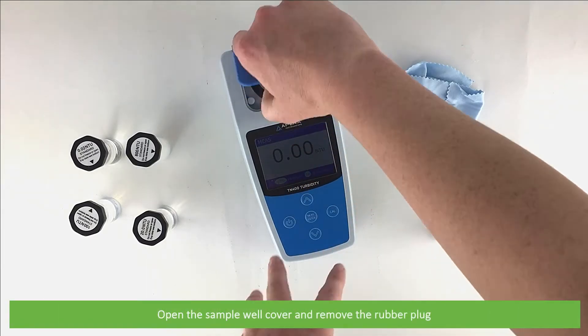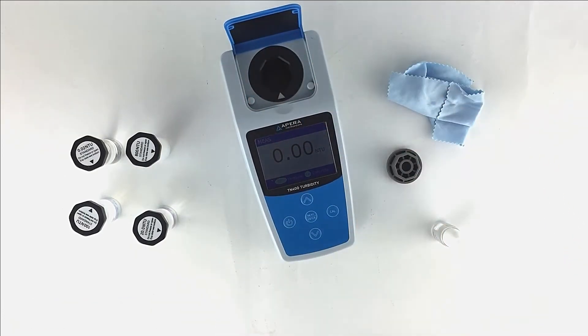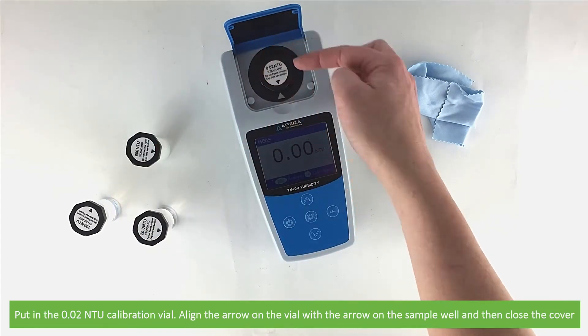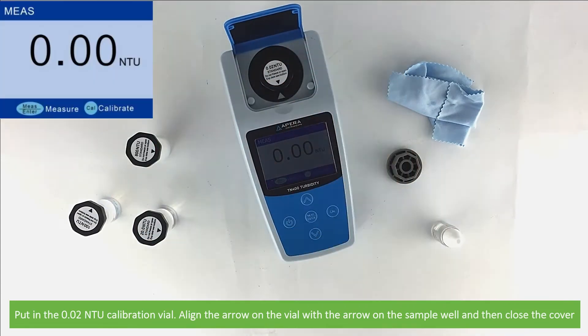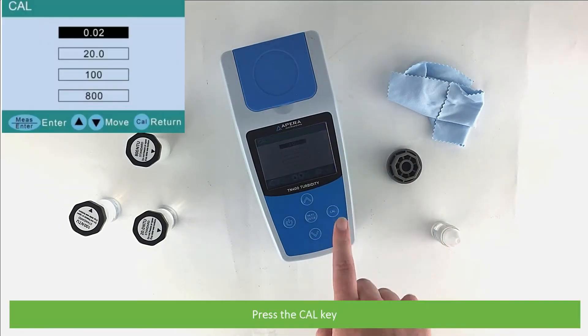Open the sample well cover and remove the rubber plug. Put in the 0.02 NTU calibration vial. Align the arrow on the vial with the arrow on the sample well, then close the cover.